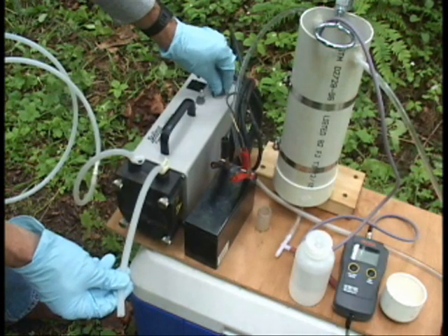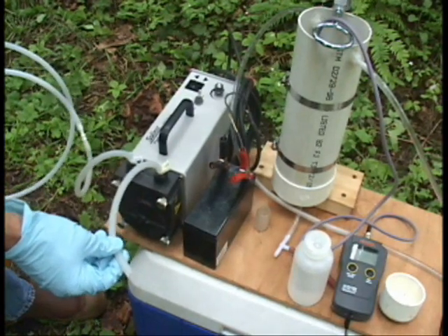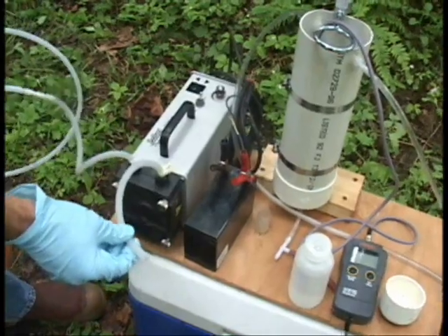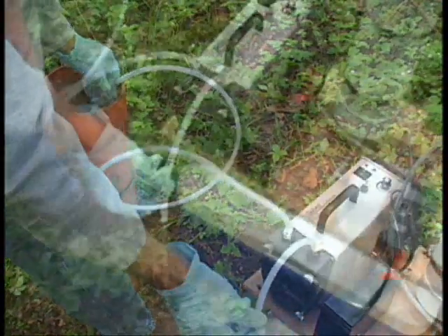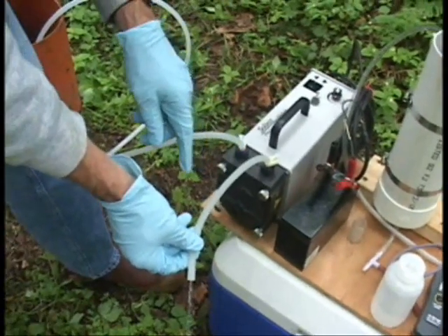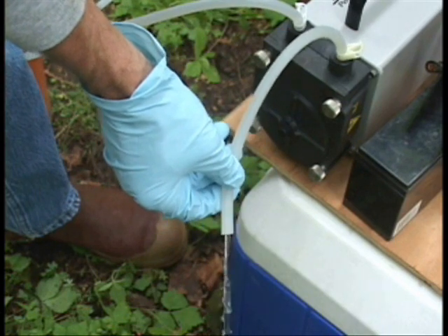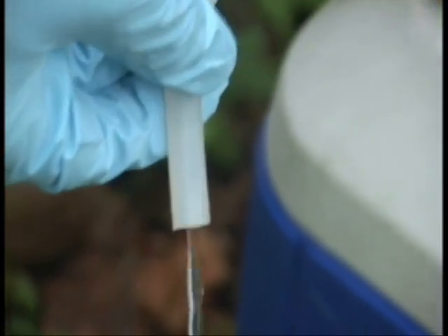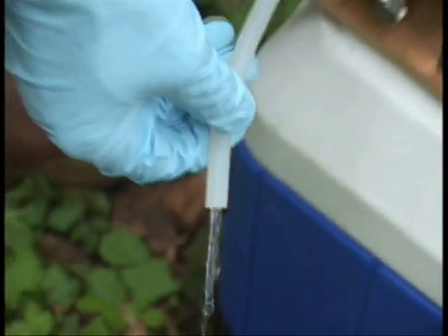We start up the pump. We have water discharging. What I do is let this discharge for a little bit, just in case there's been some sediment or some accumulation in the well that might interfere with the discharge to the flow cell. This looks pretty clear, so I'm going to go ahead and hook it up to the flow cell.